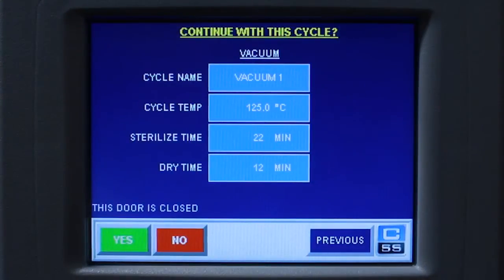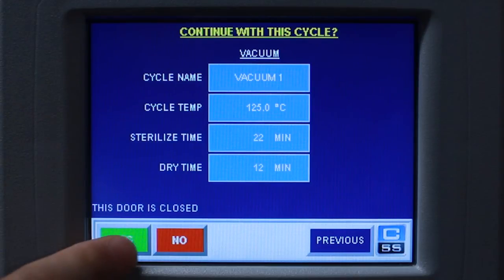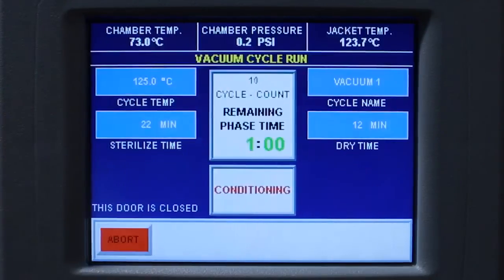Once you have verified your cycle parameters and the door is closed, press yes and your cycle will start.